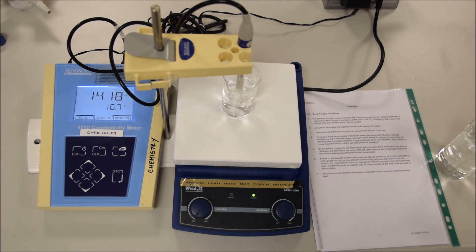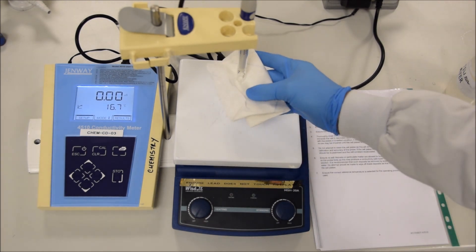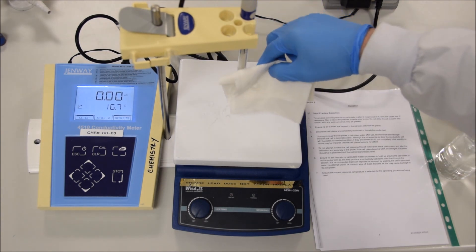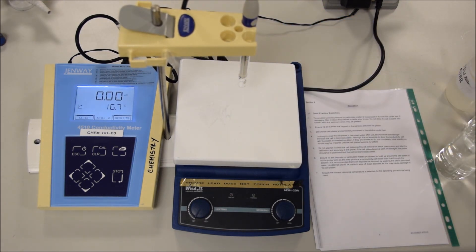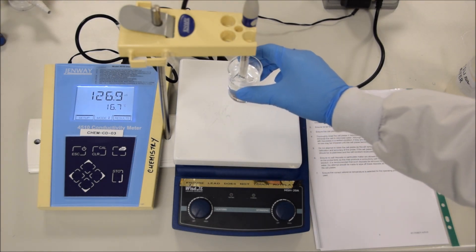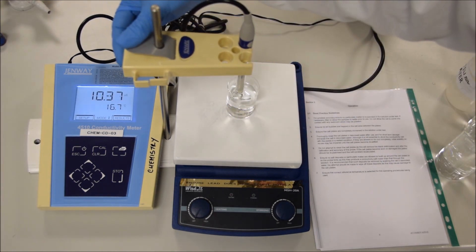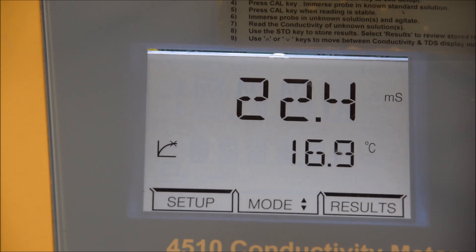Alright, so we have our calibrated machine. Let's take a reading. To take a reading, make sure the probe is clean and dry — dry the outside of it, and never put anything inside the probe. Then take a beaker and fill it with the solution that you want to measure the conductivity of. Put that into the center, make sure it's got a stir bar in it, and then carefully drop the probe down so that it's about one centimetre off the bottom of the flask. Wait for it to come to equilibrium, turn the stirring on, wait for it to come to equilibrium, and then you get your reading.